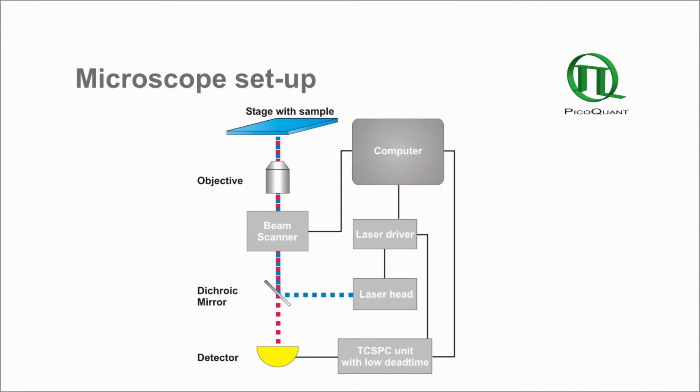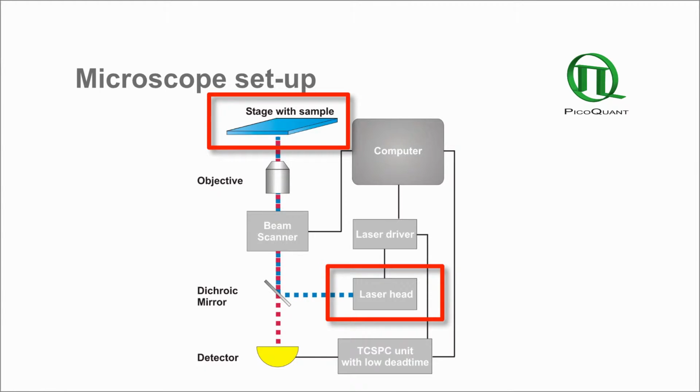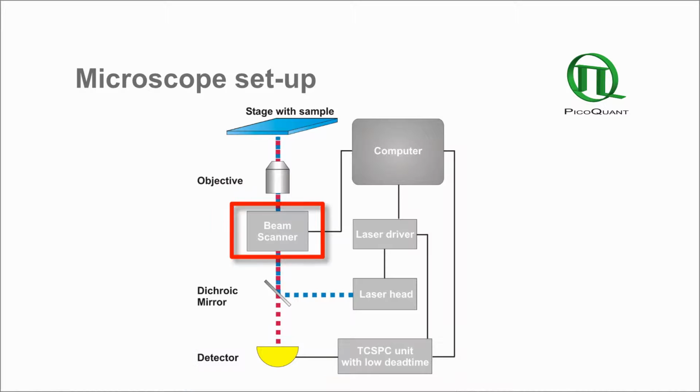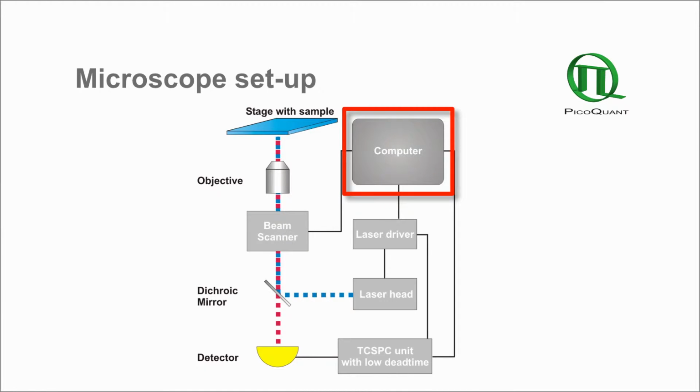On a confocal scanning microscope, a FLIM image is acquired by scanning the pulsed excitation laser across the sample. Photons are recorded with single photon counting detectors and processed with the timing electronics. Using line and frame markers provided by the scanner, the spatial origin of the photons can be determined and all counted photons are sorted into their respective pixels for further image analysis.